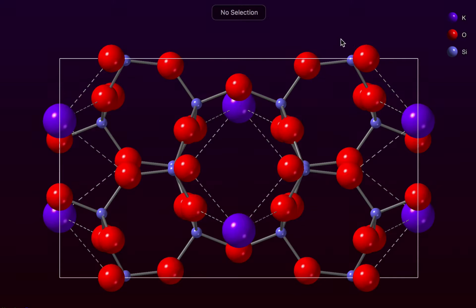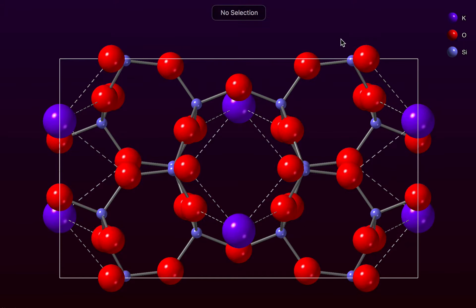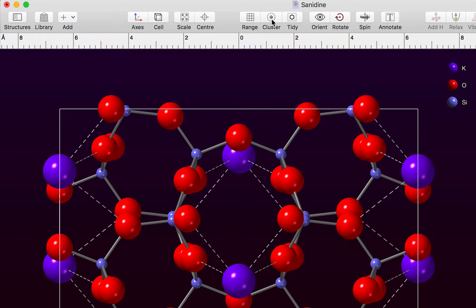Now if you're not interested in selecting a particular atom but you just want to know the environments around a certain site, you can still use the cluster command and we can choose a site using the pop-up.